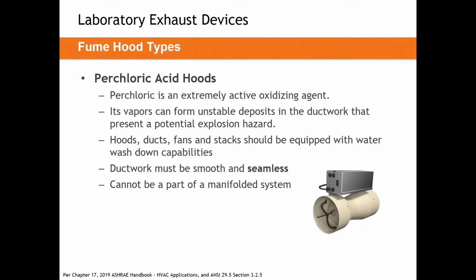The same would go for floor mounted or walk-in fume hoods. These are really just bigger, different style VAV hoods, or maybe even constant volume hoods. We won't spend too much time on those today. However, one thing we'd like to talk about here now that's more of a unique product is the perchloric acid hood. Perchloric acid is its own separate entity.